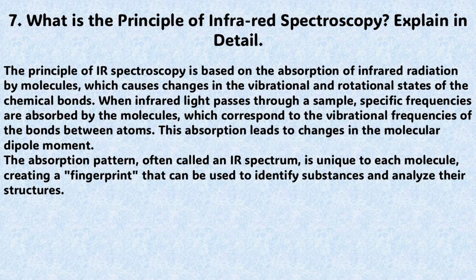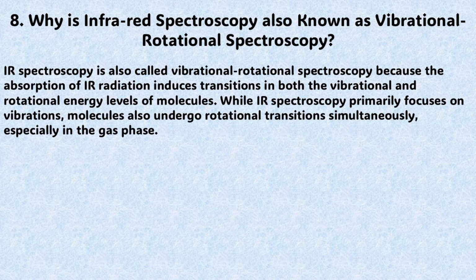This absorption leads to changes in the molecular dipole moment. The absorption pattern, often called an infrared spectrum, is unique to each molecule, creating a fingerprint that can be used to identify substances and analyze their structures.